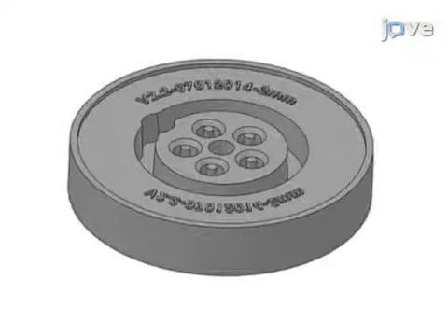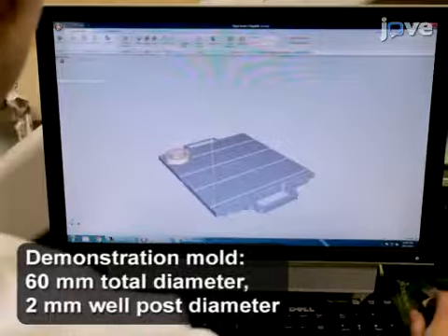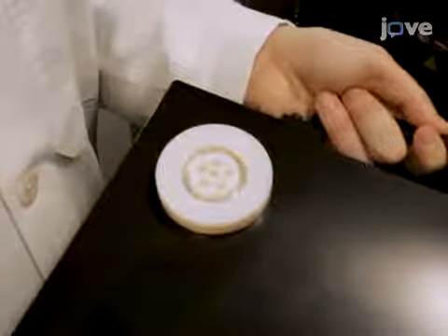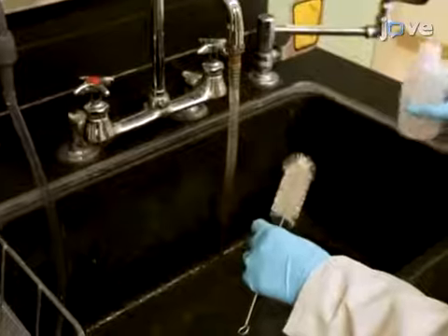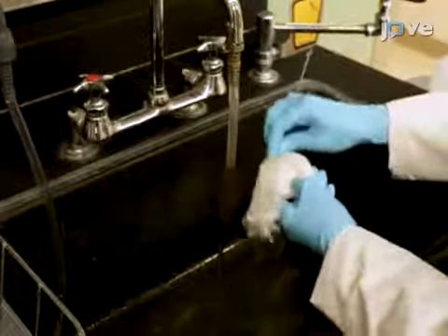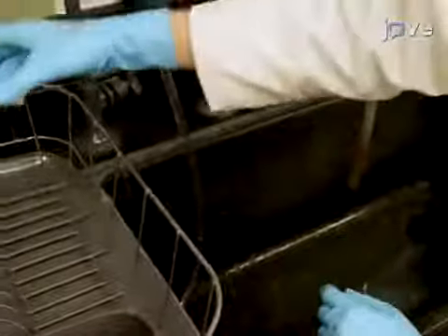To begin the procedure, use computer-aided design software to create a drawing of a mold in the desired dimensions. Send the CAD file to a high-resolution 3D printer. Print the mold in a plastic with a glossy finish that is stable at 50 degrees Celsius. Thoroughly wash the printed mold with a brush, detergent, and water. Rinse the mold with distilled water and let it air dry in a rack.